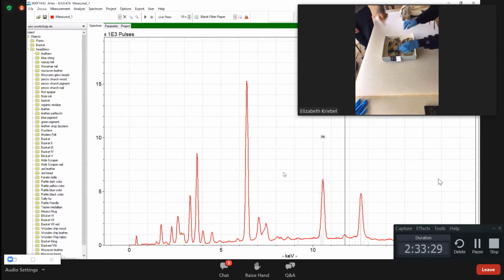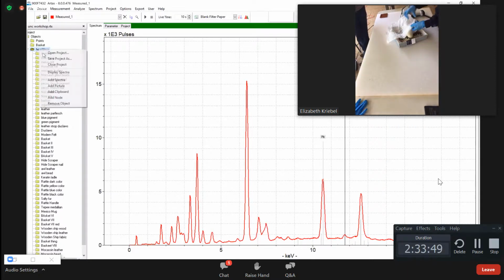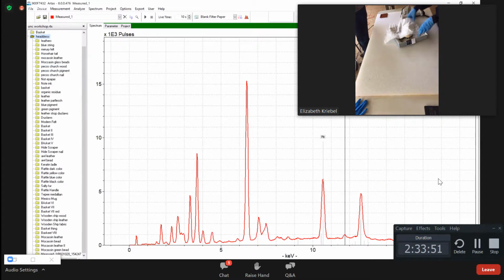No, it's treated. Okay. If you're measuring right here, right? Yeah, the leather here is treated, it has got lead on it. Oh, okay. So yeah, it's also salt washed, but lead is on top of that. A lot of lead. Do we want to test any of this coloring? It's going to be a lead-based glass. Yeah, this is one of them. And that was the leather. Yeah, it was. I think that's why we have this one covered, because of the lead.